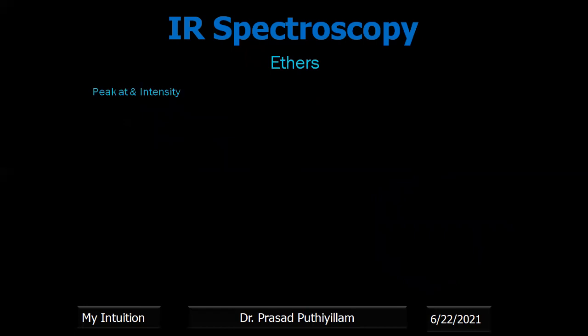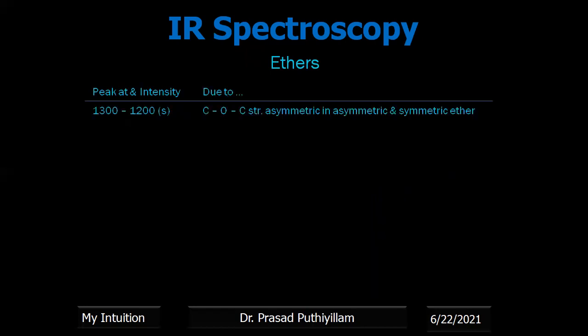So a strong intensity around 1300 to 1200 is the COC asymmetric stretching in asymmetric or symmetric ether. What is asymmetric stretching, and what is symmetric stretching, is explained in my previous video. Please watch that and compare.